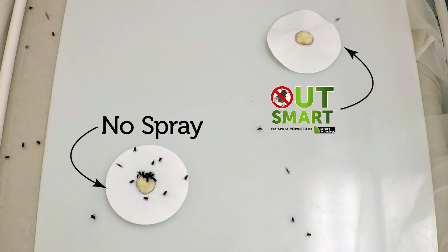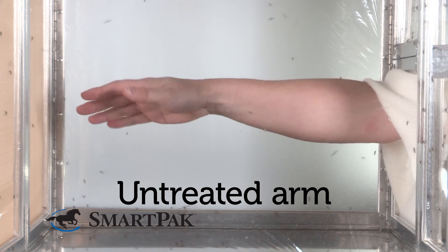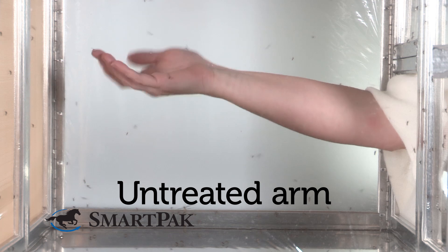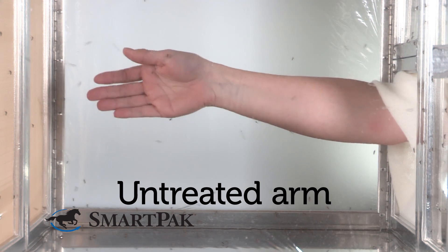In the mosquito arm and cage test, we take one individual. They have one arm that is untreated and another arm that is treated. The untreated arm is first placed into the cage for one minute. The mosquitoes are allowed to freely respond to that arm, after which time the arm is removed and the treated arm is placed into the cage.